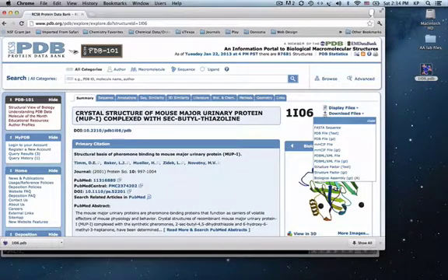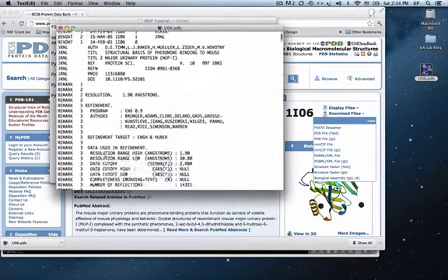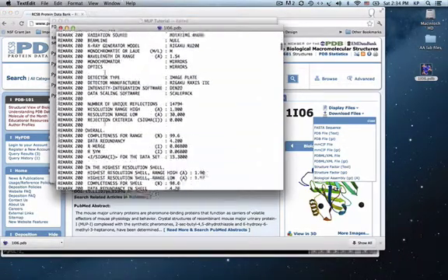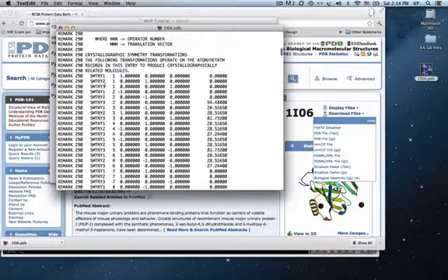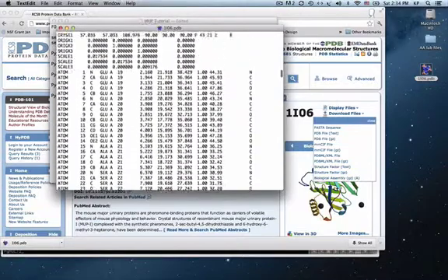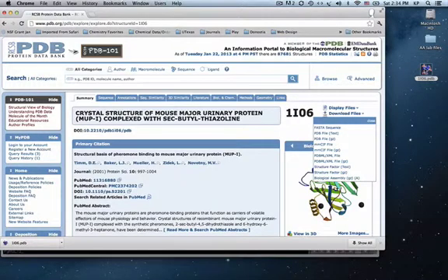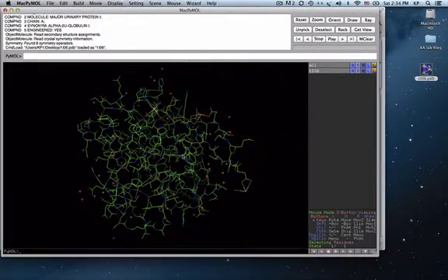And now, if I want to look at this, I can look at it in two ways. I can go to text edit and see the code. Now, what the crystallographer enters in here is basically, let's get down to the sequence. They enter these in, each atom at a time, what atom it is, and coordinates in 3D space. So these text files are actually modifiable, and you can change them if you want for your protein. However, we're going to just view this in PyMOL.